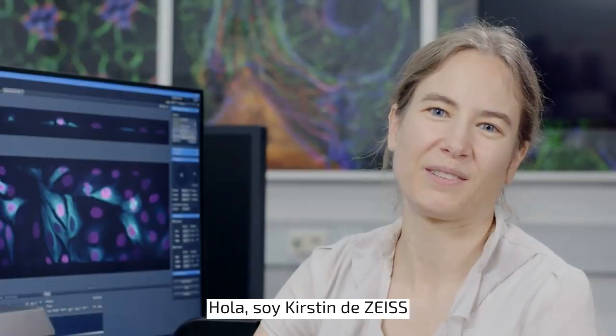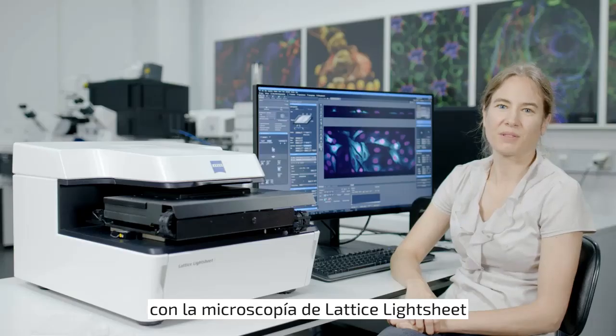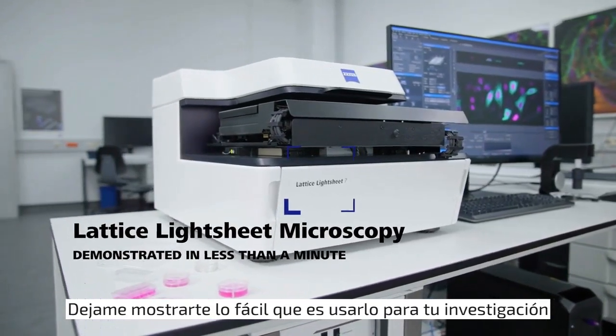Hi, I'm Kirstin from Zeiss. The microscopy community has been buzzing with excitement about lattice light sheet microscopy. I'm excited to show you the Zeiss implementation of this technique. Let me demonstrate how easy it is to use it for your research.